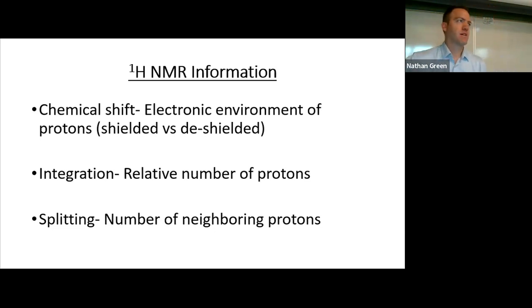The last thing we need to talk about is our last spectroscopic technique called NMR. So typically when I give this talk, I'll have a few slides here at the beginning about what an NMR is, how it works, but we're going to jump straight to how to read an NMR because we are, as you have noticed, a bit pressed for time. And the main thing I want is for you to be able to deconvolute, to be given a spectrum and a formula, and tell me what the full chemical structure is.